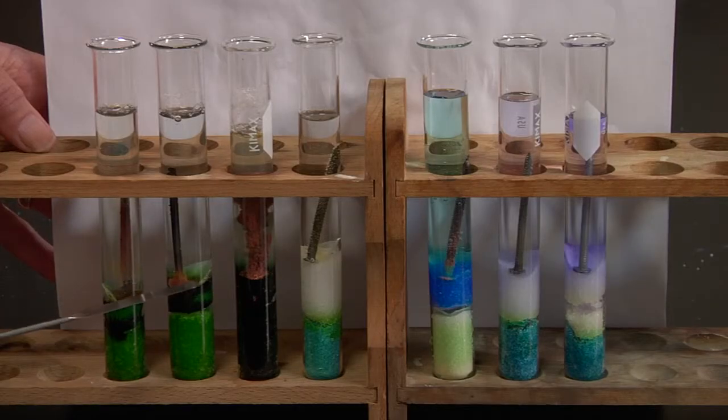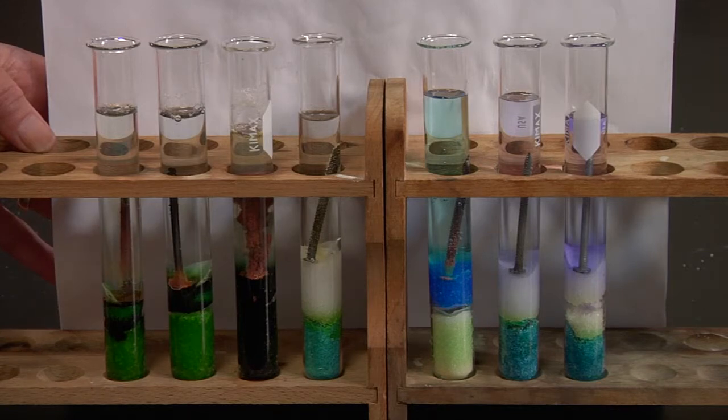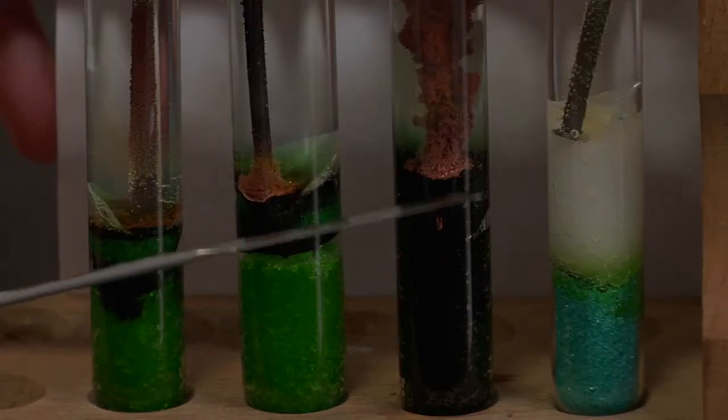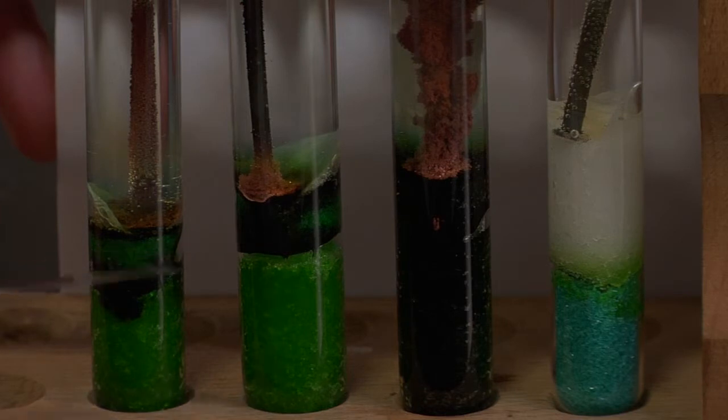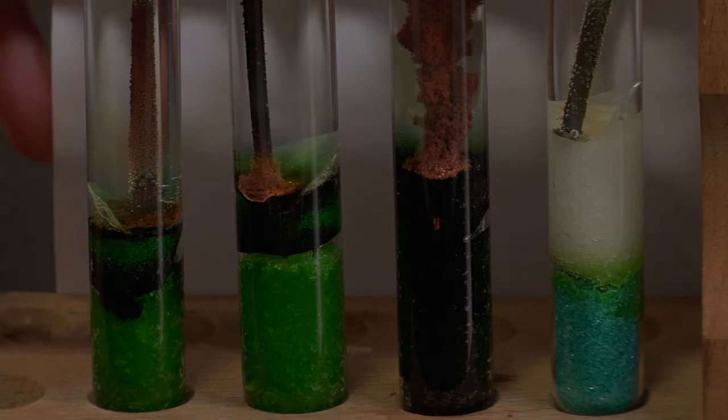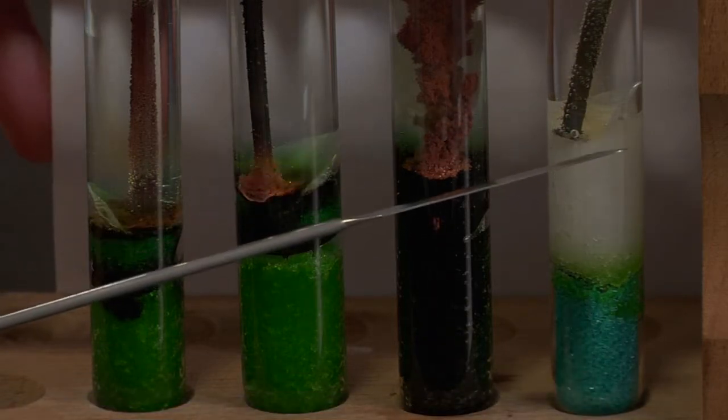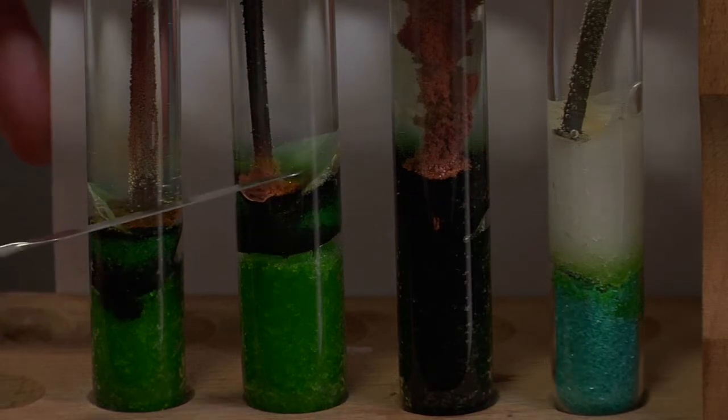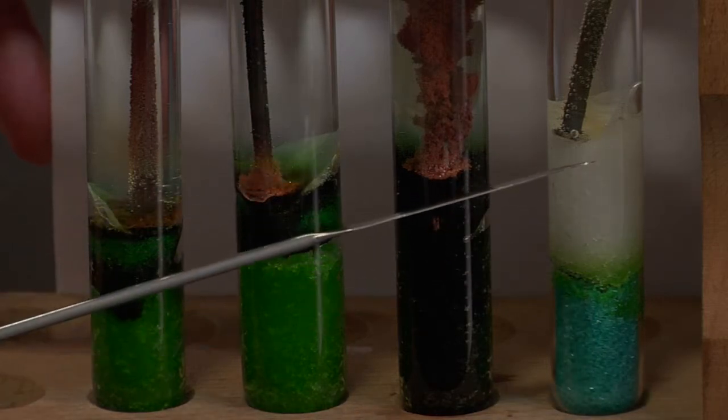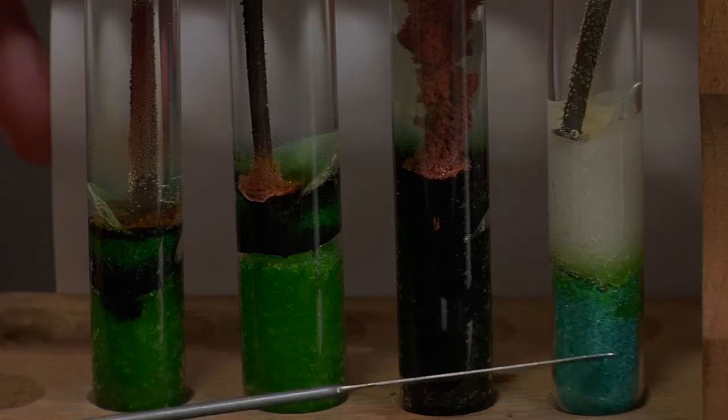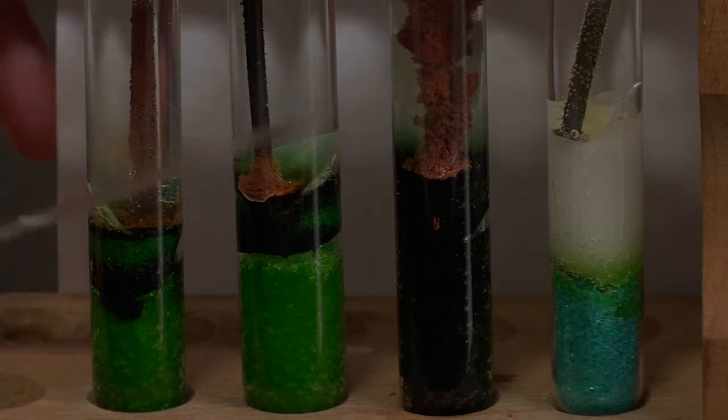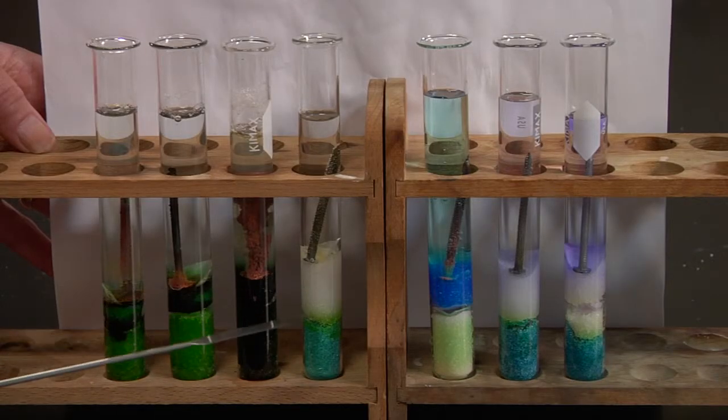These two, the only difference was galvanized and non-galvanized. The difference between this one and these two was the nail was pointed down instead of the head being pointed down. In this one, the only difference is the sodium chloride was on the top and the copper chloride was on the bottom. So we're beginning to see some interesting patterns in the copper chloride test tubes.